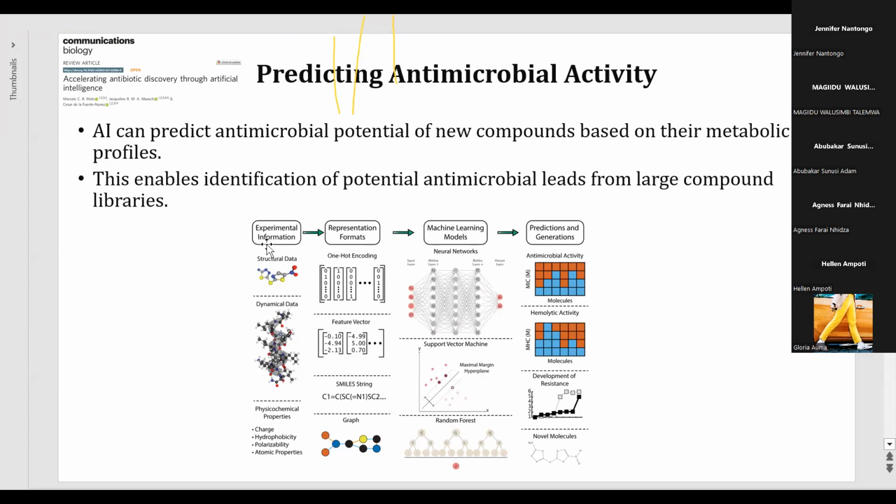So you see, all these are artificial intelligence simulations, which even I can't understand much because these are all different algorithms, but I can understand the steps. So this is the structural data of the metabolite.